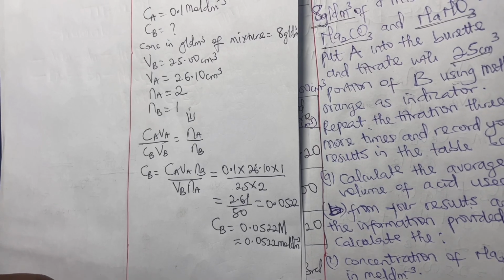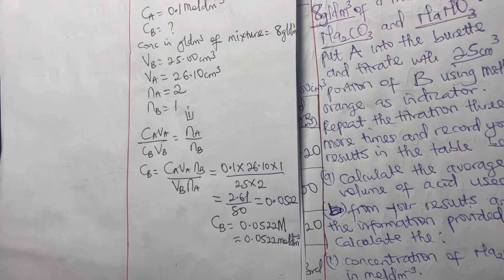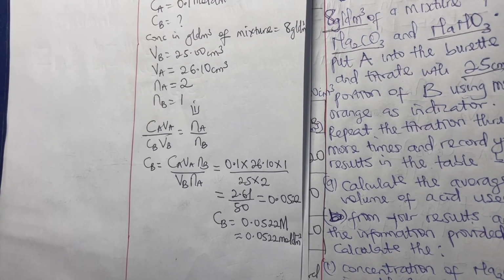Always put this in three significant figures. Always put your concentration in three significant figures. It's very good. So I'm done with the I.